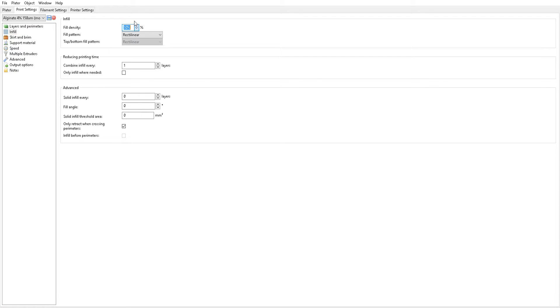Over to fill density, you're going to try and stick between 20 to 50% infill. Normally you want to hang between 30 to 35% as your standard and kind of only go out that range to 20 to 30 when you get more comfortable with the 30 to 35. But traditionally, just set this to 30 and then kind of let it be for a while.